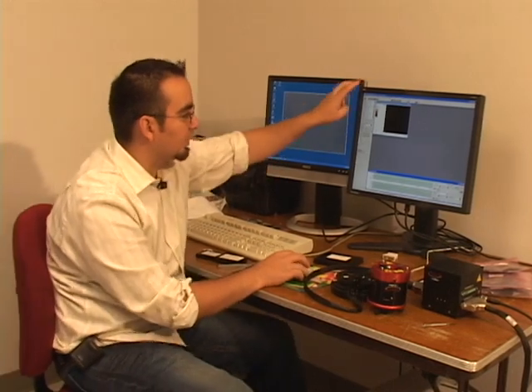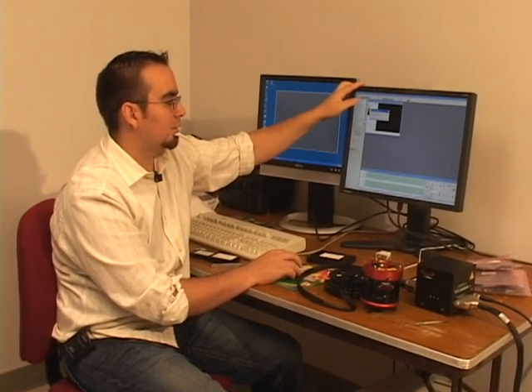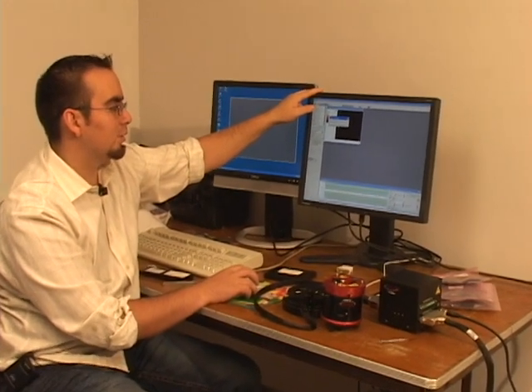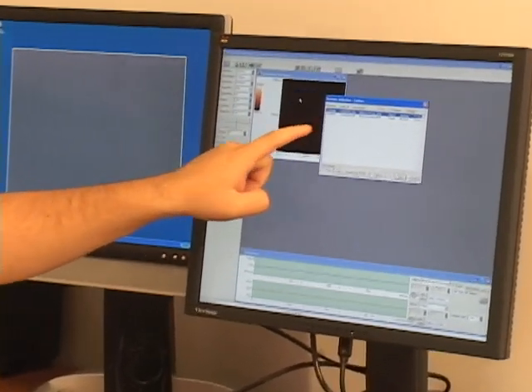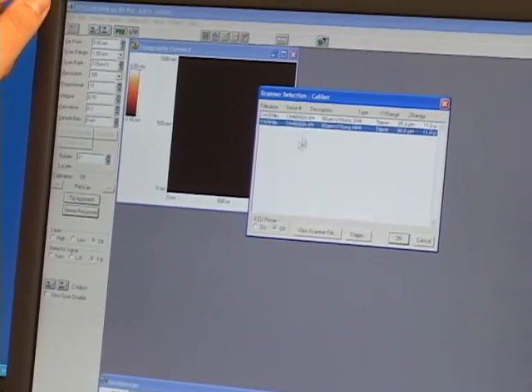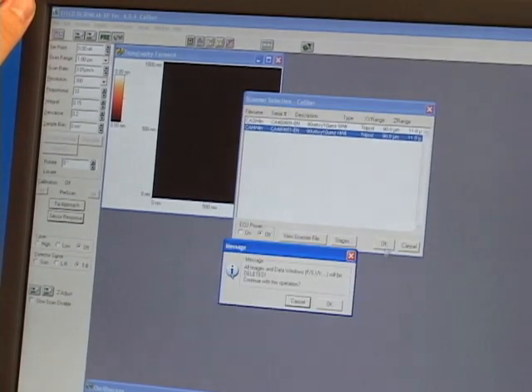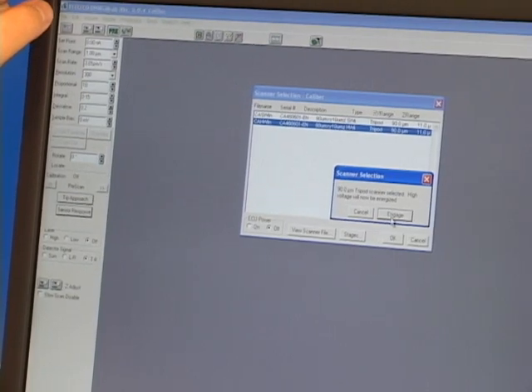So we'll click close. After that, we're going to switch over to the hardware file by going to Setup and then Scanner Select. High voltage will be switched off, of course. Click continue, and then click on scanner changed. Now we can choose the CHW lin file, the hardware linearized, and then click OK. OK again, and then engage.